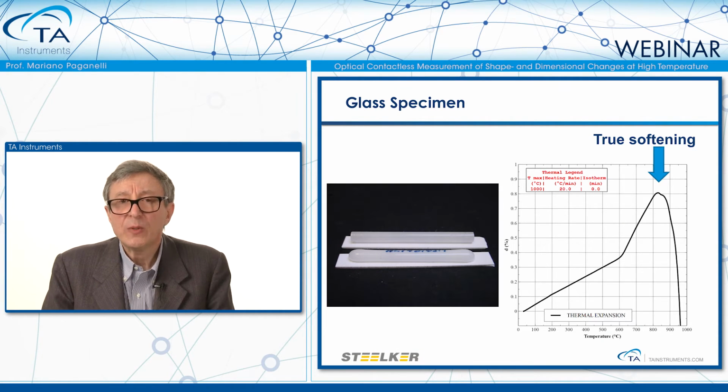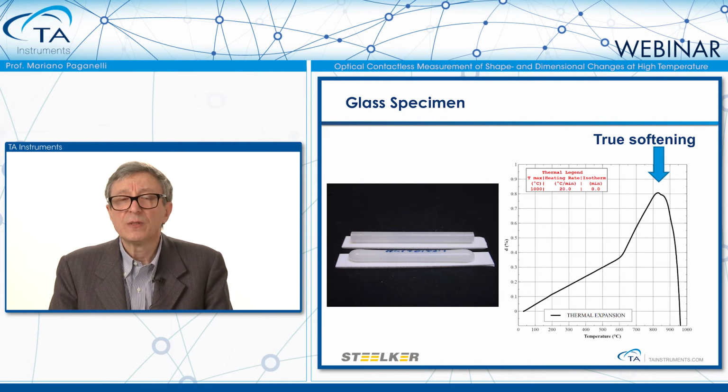This is an example of thermal expansion measured on a glass rod.